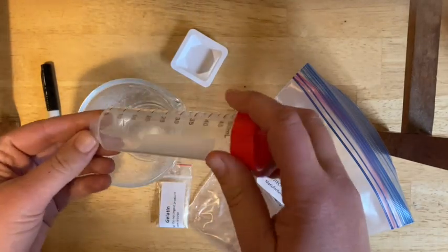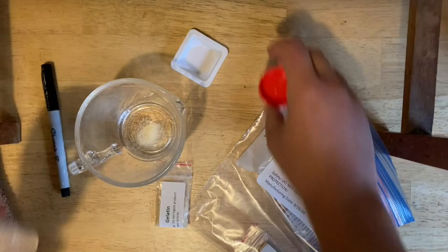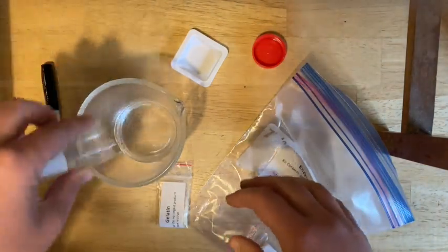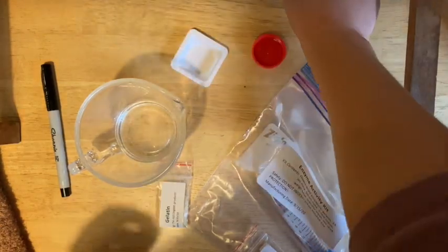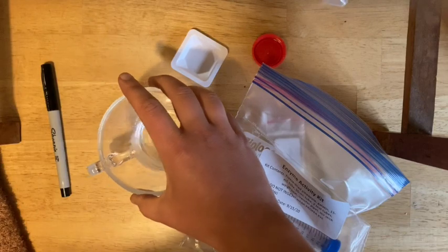Make sure you check your notebook for how much water you should measure out. You're going to use tap water and add it in. The gelatin can go back in your container, and you're going to microwave this to melt it.